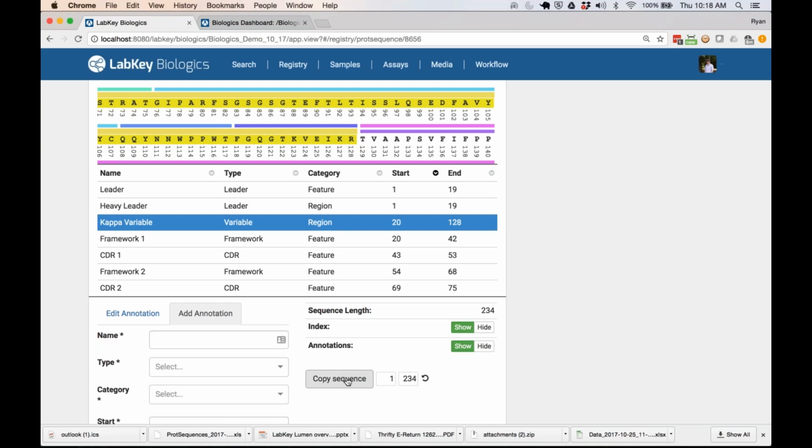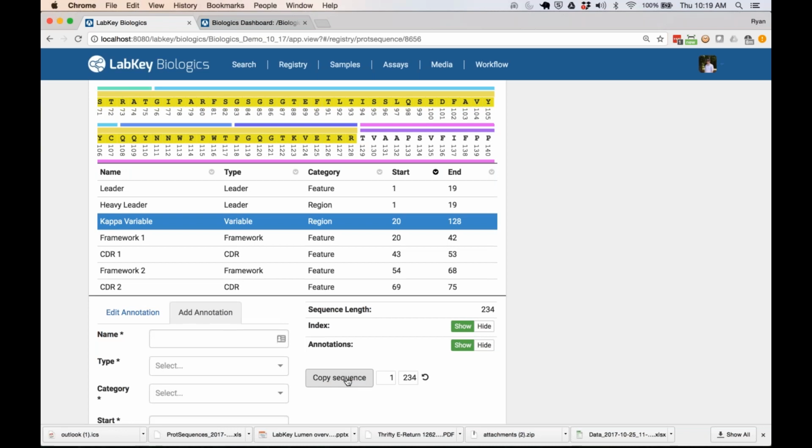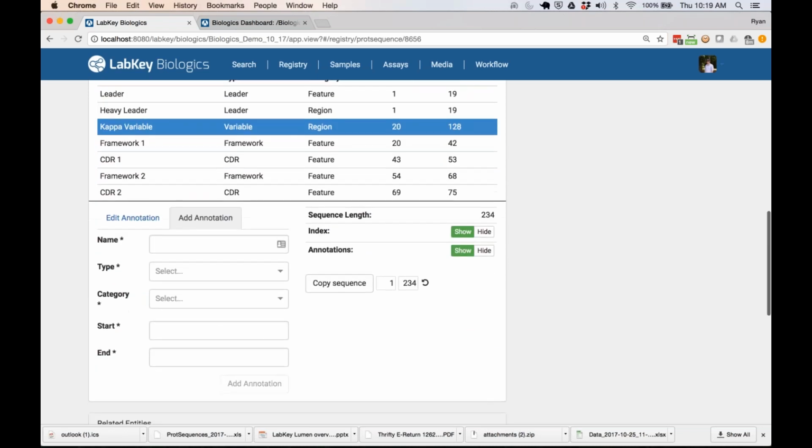And this is a recurring theme with everything in LabKey. We know that there are some folks who want you to do all the manipulation of data within the application itself. With LabKey, we know that's not really a possibility. You're going to have other analysis tools, other ways of viewing these things, and so we always try to make it as easy as possible to both get data out, in this case, and also to get data in. So those are always options within the system itself.